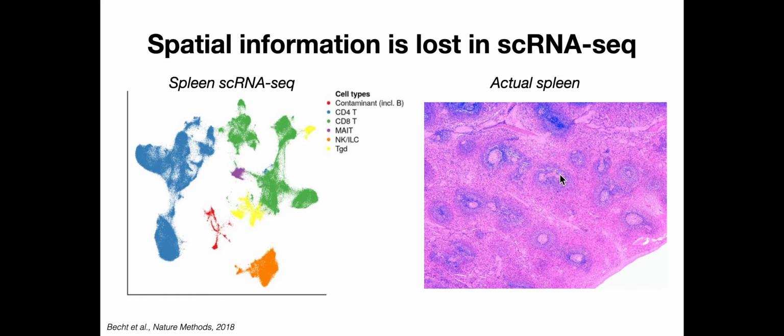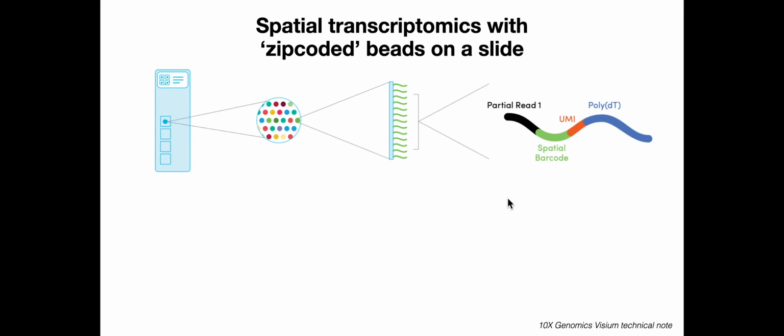And so conceptually, that's not all that different than what we talked about, the technology hurdle that Illumina struggled with, where they were trying to figure out how to amplify molecules on a solid surface, ultimately doing that through bridge amplification. The same concept applies here to tissue. We'd like to take transcripts that are too hard to image or visualize or sequence in a tissue and build them up so that we have enough signal to detect them in the tissue. And so methods have already been developed that really get to this problem.